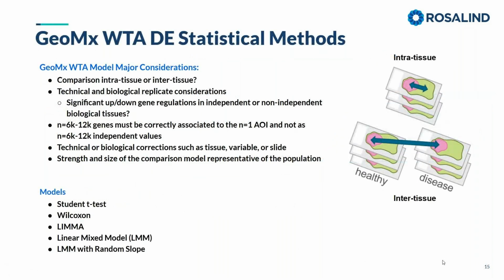But to best consider this, I have a beautiful image of how you want to look at this statistical model. So the first thing to understand, which we just talked about, was the method, the technology, your model itself, what your data looks like. But then you also want to consider those next steps, which are those replicates and the comparisons that you want to set up.